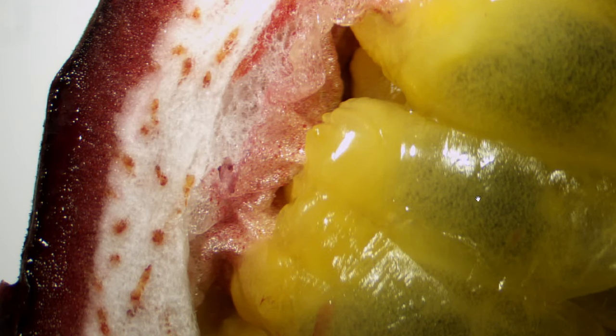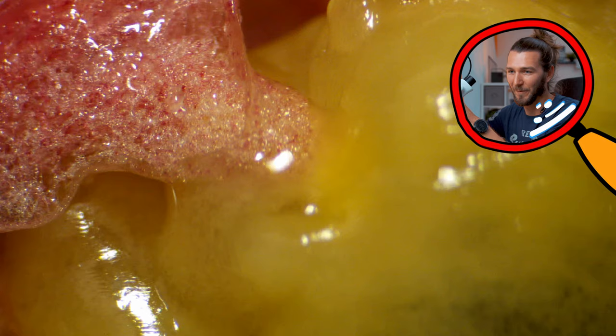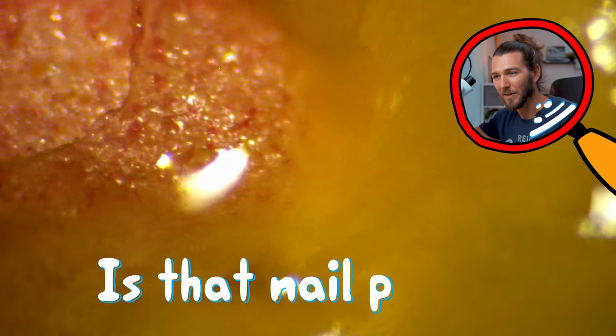We eat this yellow stuff, and the dark spots are the seeds. If you move into the middle it looks like a huge bee nest! How many of you knew that passion fruit looks like this? In commercials you just see the image, but you don't see how it really looks. Let's zoom in — you can see the connection here, the yellow part that we eat. So delicious — it's one of my favorites. It looks like nail polish up close!